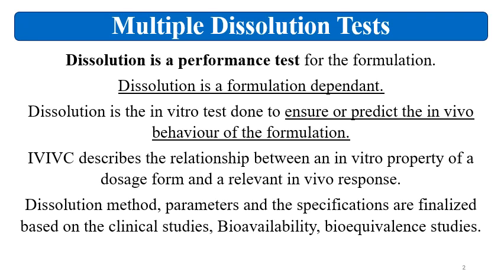Then IVIVC describes the relationship between the in vitro property of the dosage form and the relevant in vivo response. Now see, there is a relationship between the dissolution and the in vivo behavior of the formulation. So that correlation is the relationship between the in vitro and in vivo response. So that is called as IVIVC. Then the dissolution method, parameters and the specifications are finalized based on the clinical studies, bioavailability and the bioequivalence studies.